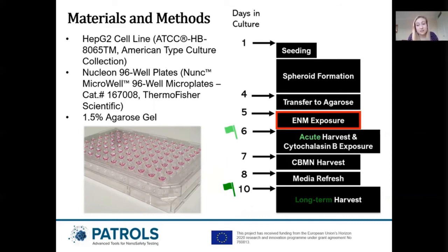In addition to this, and believe it or not, the 96-well plate you use is important, as the lids on some of the plates can be looser than others, which makes it more difficult to form full plates of spherical shaped spheroids. And then most of the reagents will be prepared on the day of, but the 1.5% sterile agarose gel will need to be prepared in advance.